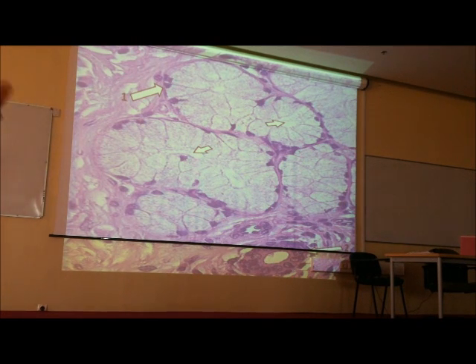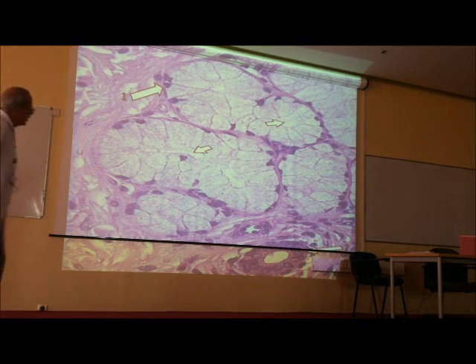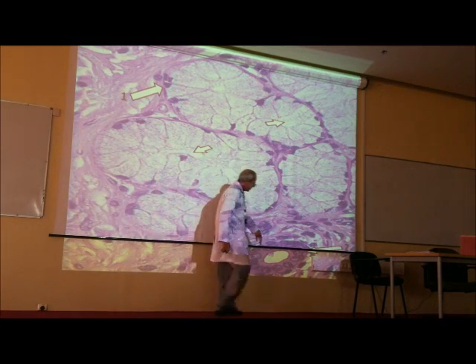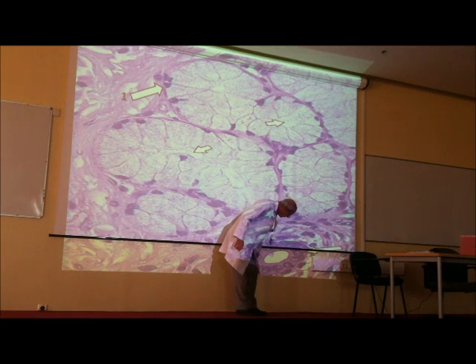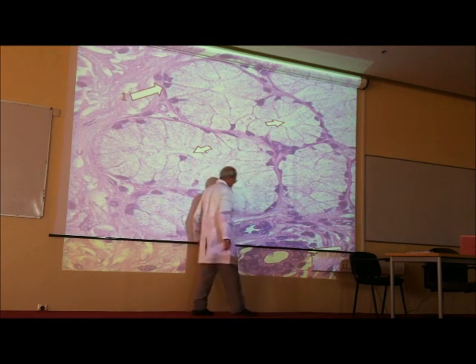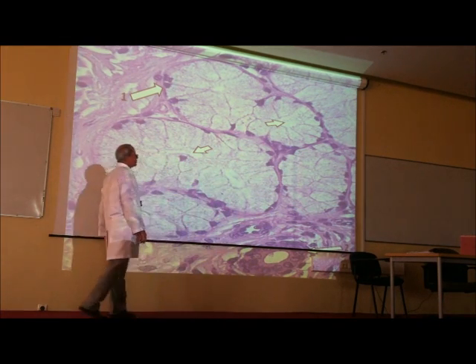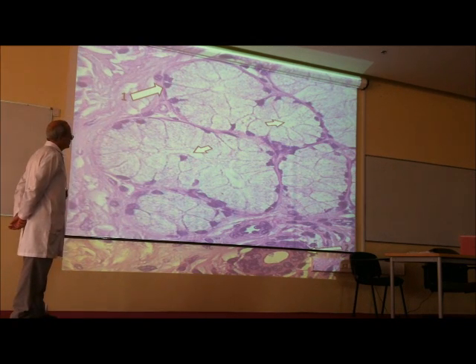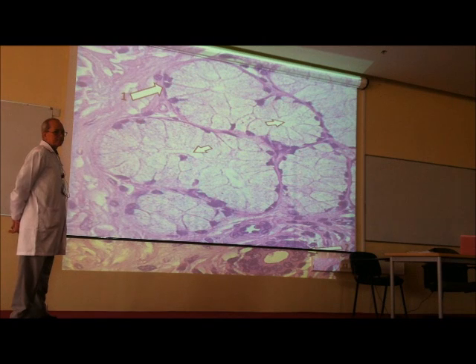Okay, esophageal gland. What is about the lower part? No, here, but it's not clear. Here. Serous acini. What is about the lumen of serous acini? Is it narrow or wide? Narrow.